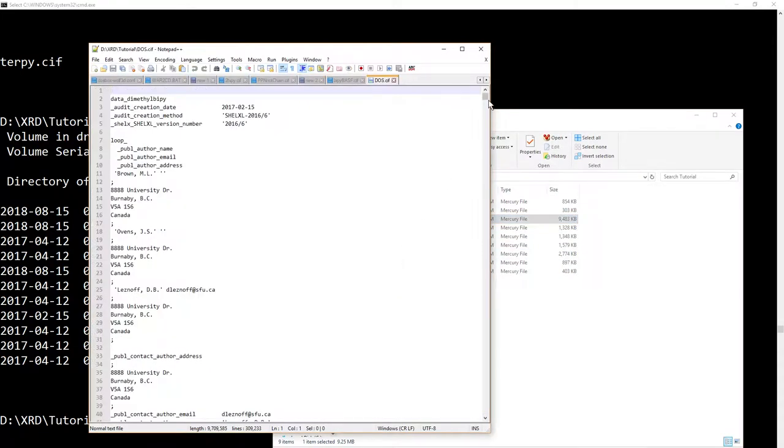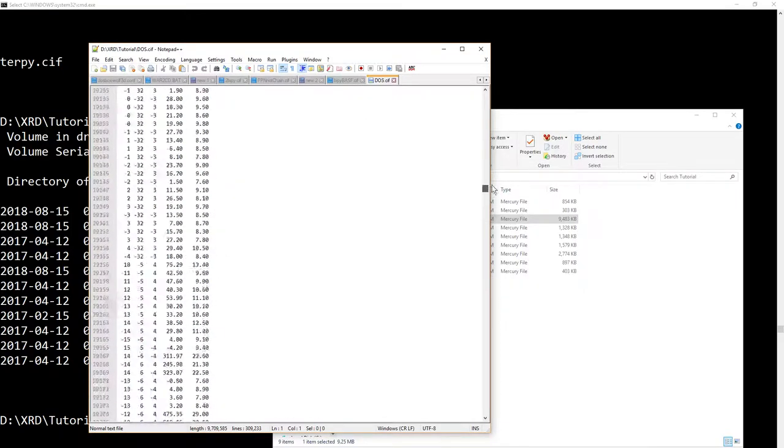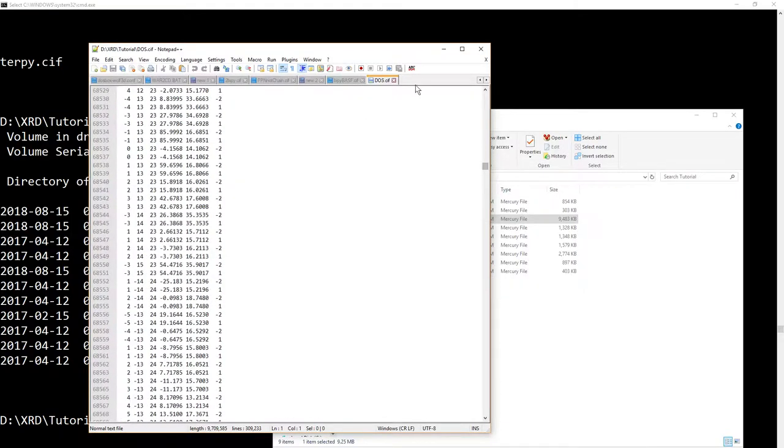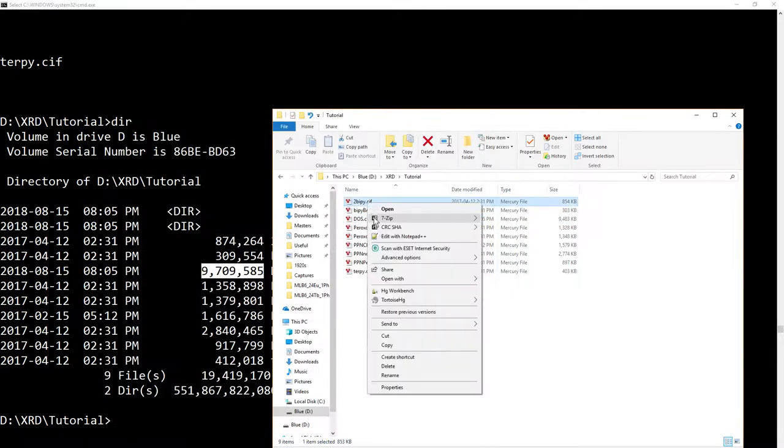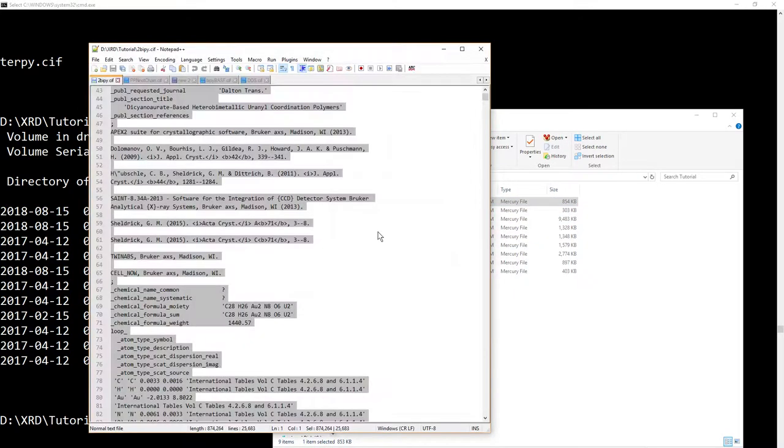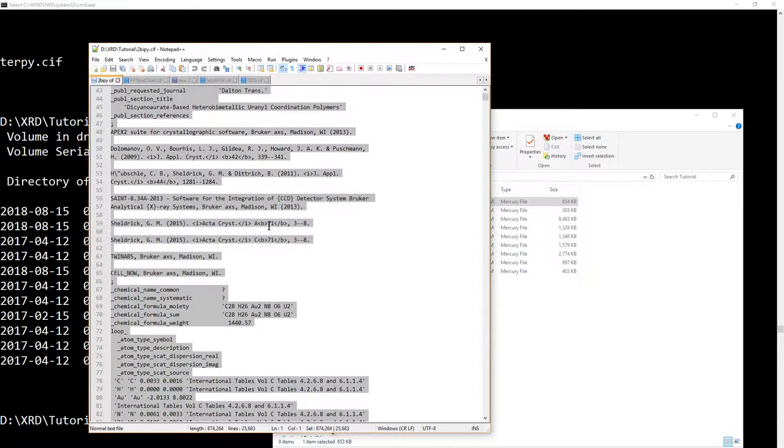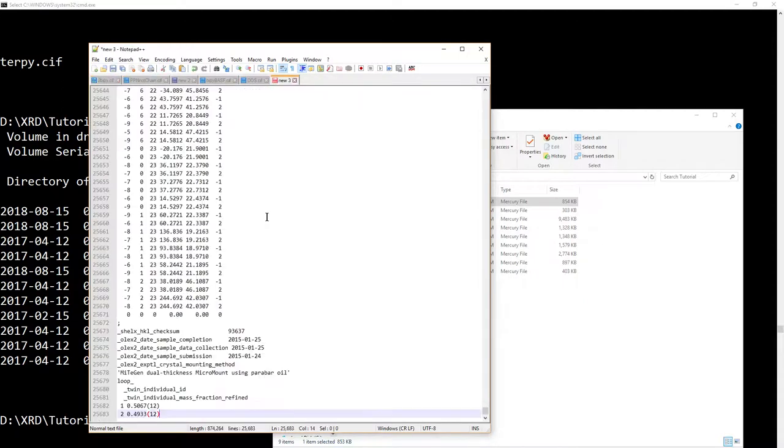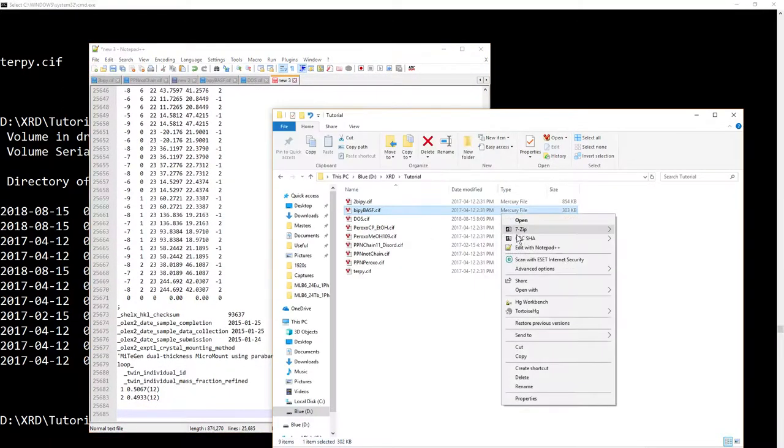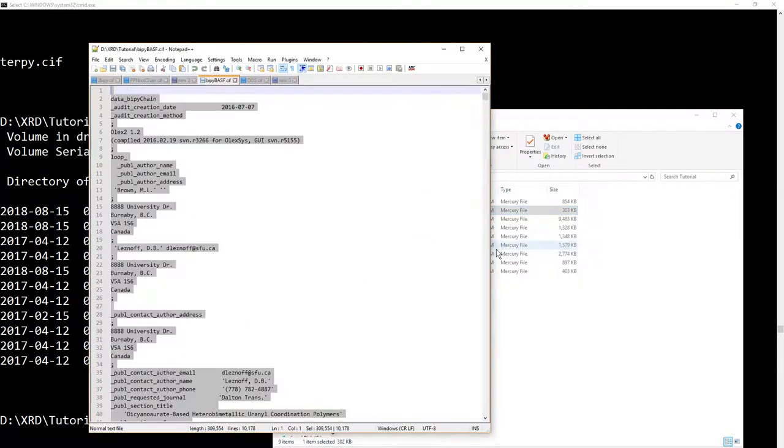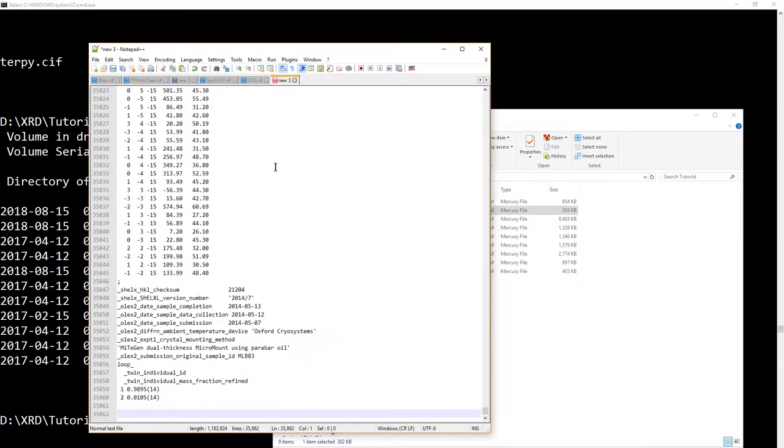And I think that's a lot faster than going to, all right, let's go to 2bipi, edit it with notepad++, select all, copy. Let's make a new file. Okay. Let's go back here, edit, copy, paste, and so on.